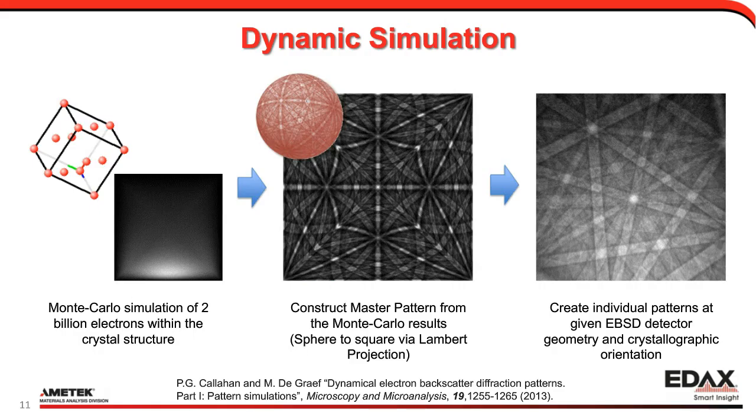because of the emergence of more dynamic simulated patterns. Through dynamic simulation, you're able to create pattern simulations that are much better than we had previously, and they look much more like experimental EBSD patterns. But I won't belabor this. There's lots of research, and you can search the literature for work in this area.